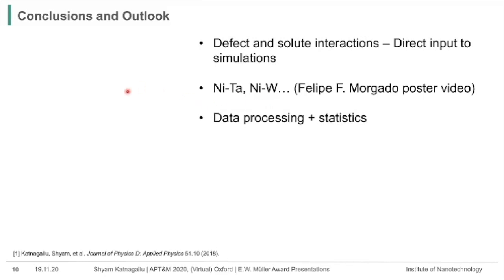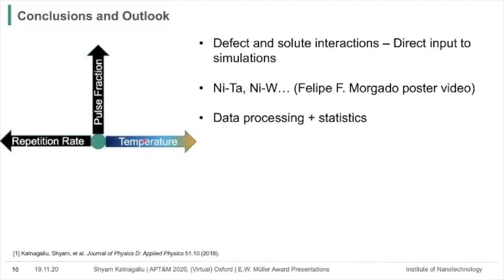The data processing algorithms which I showed you are actually very preliminary, and they can be refined further and optimized further, because contrary to the traditional experimental variables which you have in atom probe tomography, now you have additional parameters such as gas composition, that is the imaging gas composition, imaging gas pressure, which you introduce. And this renders the problem to a multi-dimensional problem, which means that once you optimize all of them, you can have a really good data quality itself.